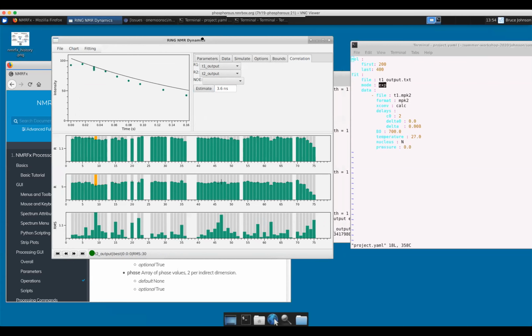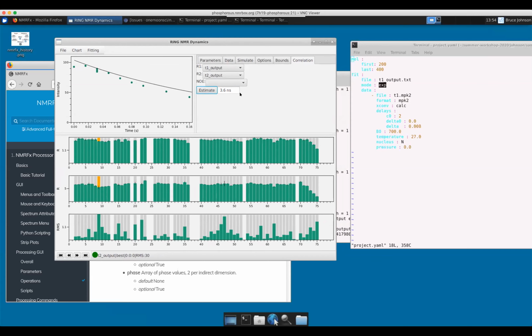I'll show you, I think what I'll do is go on to the different type of data, like the CPMG, where we tend to use more different types of models, and you can actually fit different models. At the moment in the T1, T2 stuff, we really have just a two-parameter fit, A, B, and ABC, where C is the intensity at infinite relaxation time.